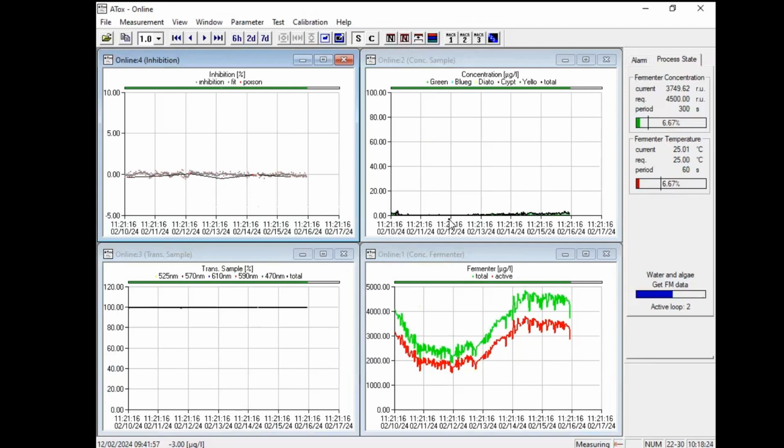But if you take up river water or lake water, there will be a curve with the concentration of the algae of the sample, and also the transmission of the sample will vary over time. It's not like here, where tap water is always 100%.